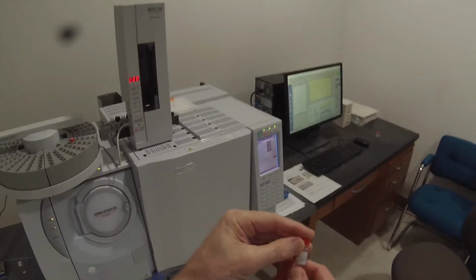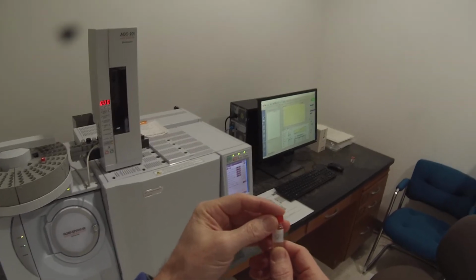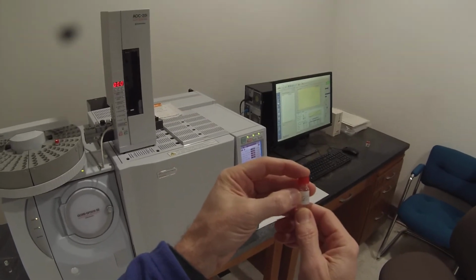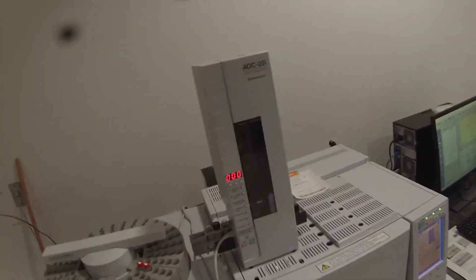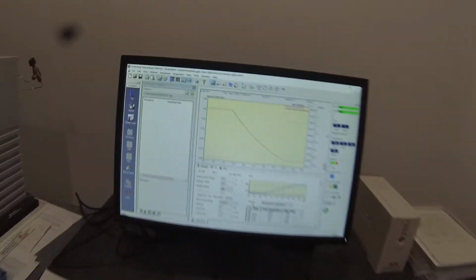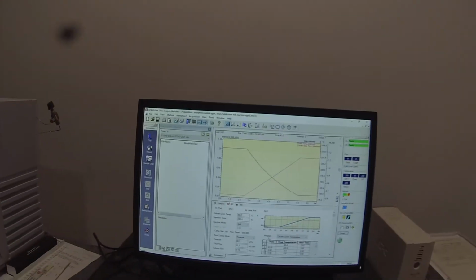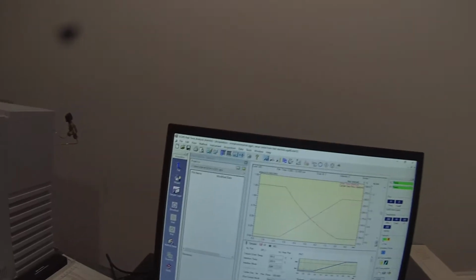We're going to try to collect some GCMS data on the product for the Diels Alder reaction. So I brought over the 56R vial, and I'm putting that in slot number 1. Now we don't have a method file for the Diels Alder reaction, but we're going to try the same method file that we used for the reaction of morpholine with t-butyl acetoacetate.